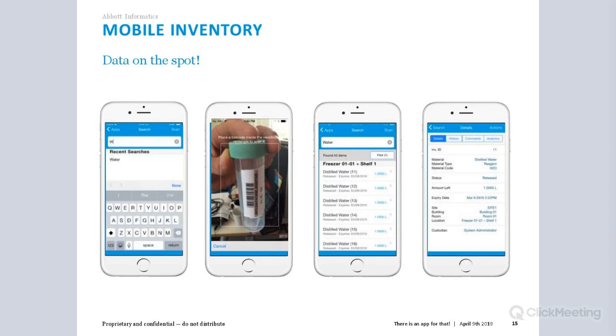Another great process improvement example I can think of is when I had to work in the laboratory, it was someone's job every Friday to go around the HPLC rooms and check each mobile phase bottle's expiry date. Anything to have expired during the week was disposed of. It was a very time-consuming task, and no one liked doing it when it was their turn.